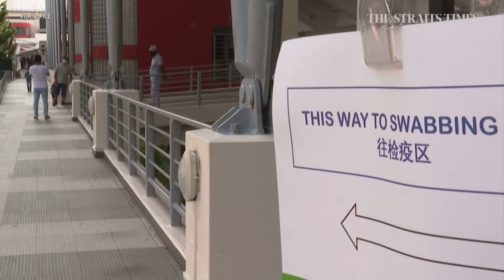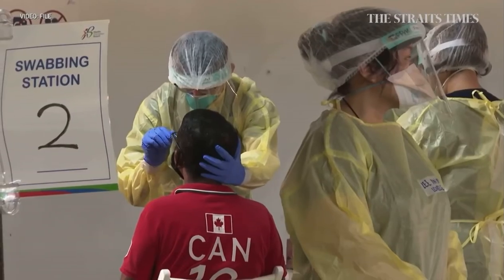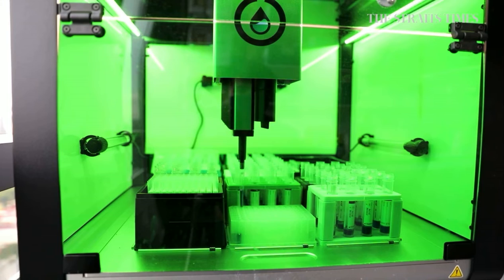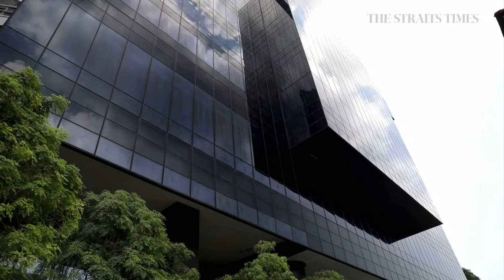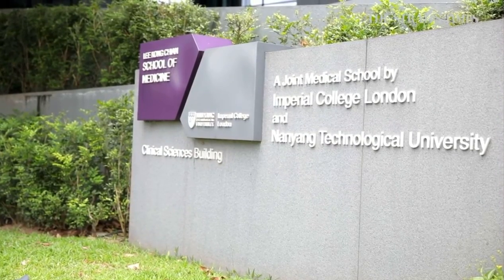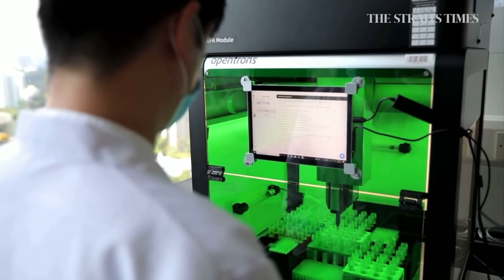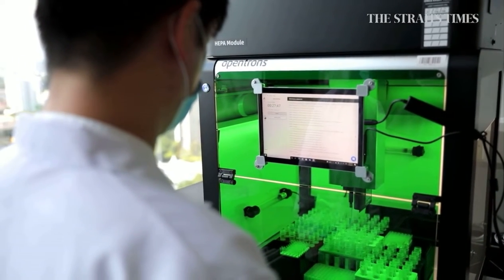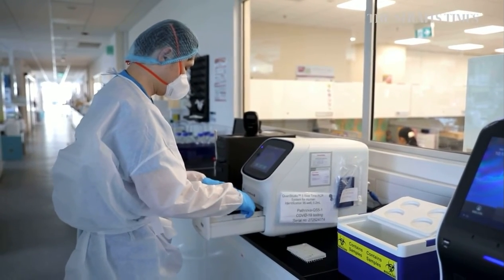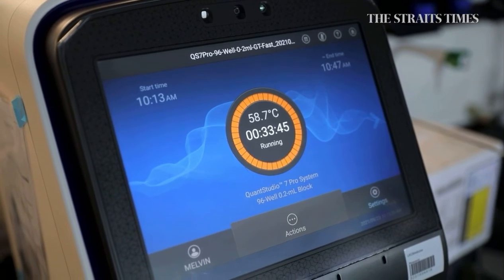The recent surge in detected cases of COVID-19 has resulted in more tests being taken. To help handle the larger workload, one COVID-19 testing lab has implemented automation. Since August, Pathnova Laboratories Lab at the NTU Lee Kong Chian School of Medicine's Novena campus has been using a robotic arm to help prepare samples for polymerase chain reaction tests. This enables the delivery of test results for clinically urgent swabs in 3 hours, compared to the usual 24 to 72-hour turnaround for a PCR test.